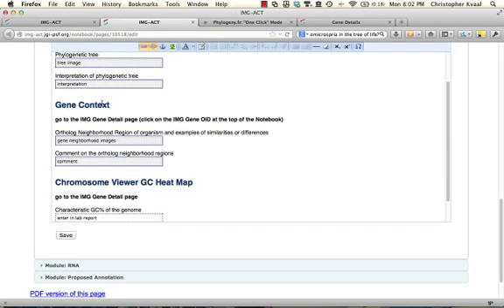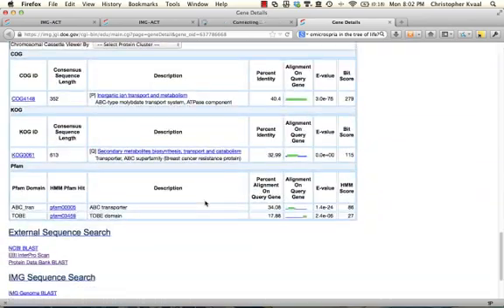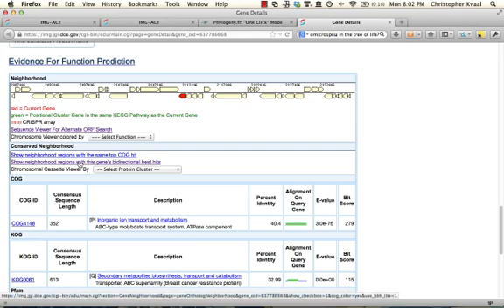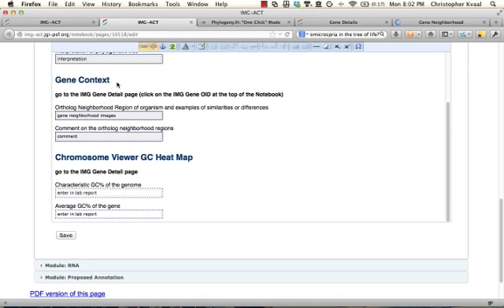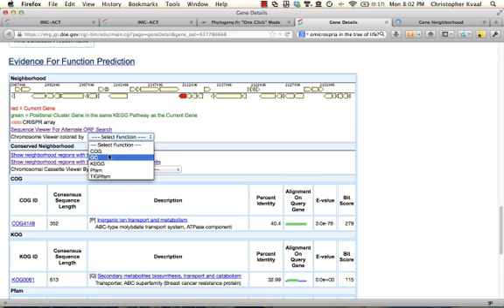Let's go back and look into the gene context. In order to get to the gene context, it says ortholog neighborhood region. I'm going to open my gene details page, scroll down, and click 'Show neighborhood regions with this gene's bi-directional best hits' — opening that in a new tab. While that's pulling up, let's go to the GC heatmap. Back on the gene details page, I'm going to look at the chromosome viewer colored by GC content.